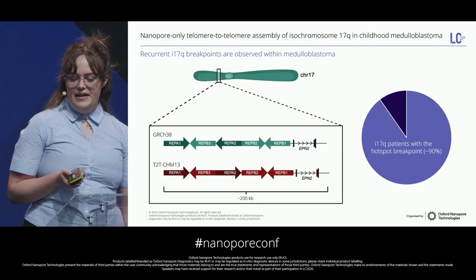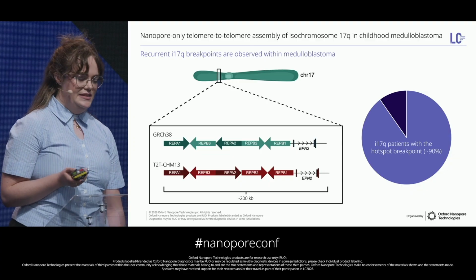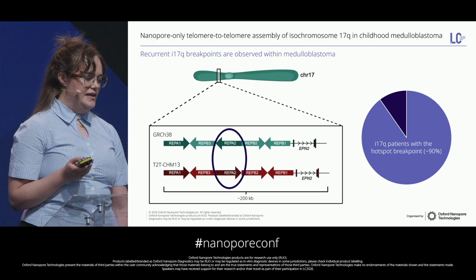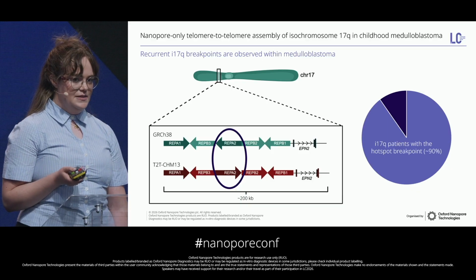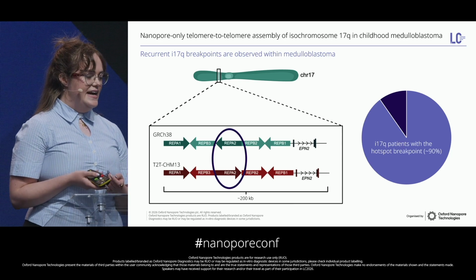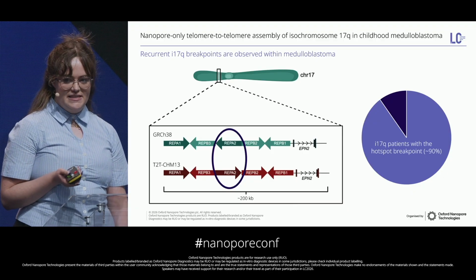Looking at a cohort of healthy individuals, we found heterogeneity in both the copy number and orientation of these repeat units. And we see this also between reference genomes. So highlighted here, in the third unit, RepA2, in T2T CHM13, is inverted compared to GRCh38. So what we have here is a hotspot region, which is highly heterogeneous between individuals, but also highly repetitive.